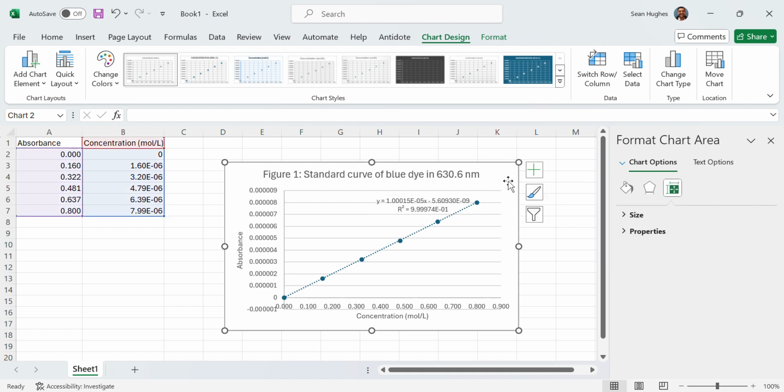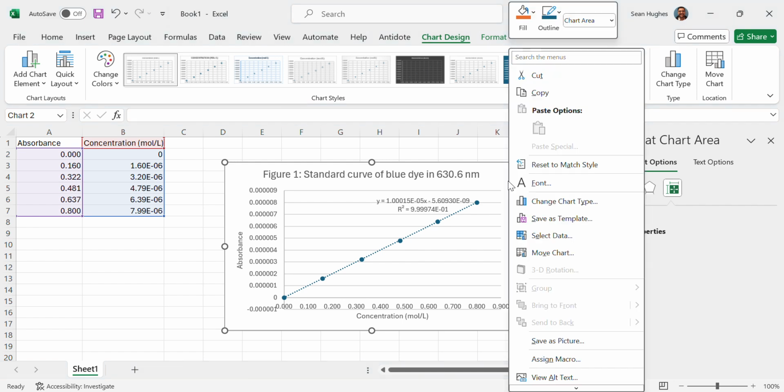Now, for your lab report, I want you to generate a full page graph to submit with your data table that you already had set up earlier. There's no need to give me the one in Excel. A really cool trick, a hack to do this, is to right click your graph when it's done and go to Move Chart.